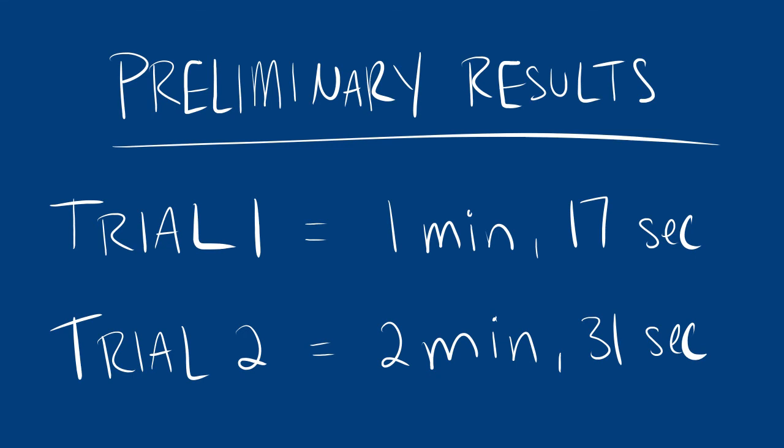So as a part of the post-lab assignment, or the lab assignment corresponding to this video, I have a number of timestamps for 5 different trials where we are varying the concentration of I- or the S2O8 2-. And in working through those calculations, you're going to be able to figure out what is the rate law expression overall, what is the rate constant overall for this equation, what is the half-life of the reactants, etc. What is a possible mechanism for the reaction? I'm sure you're all so excited to work through those calculations.